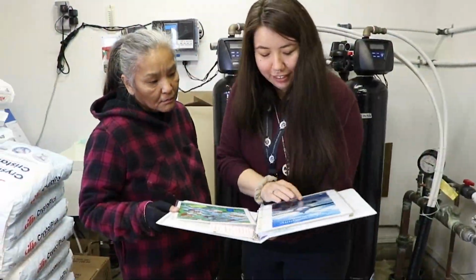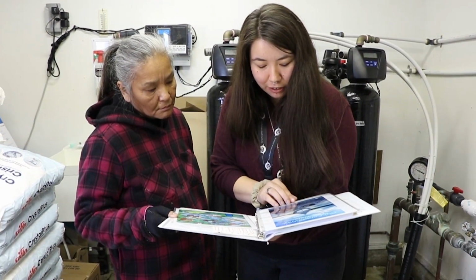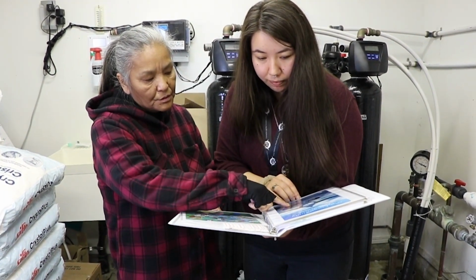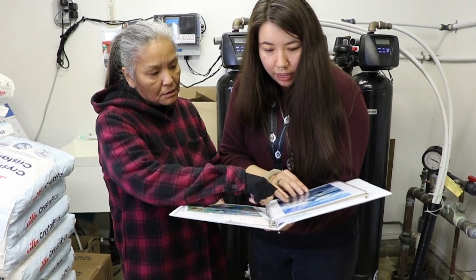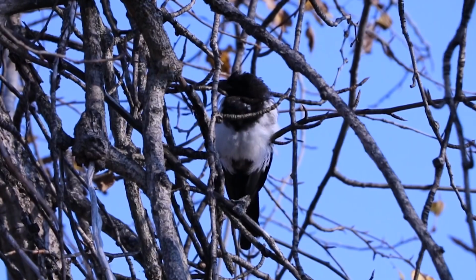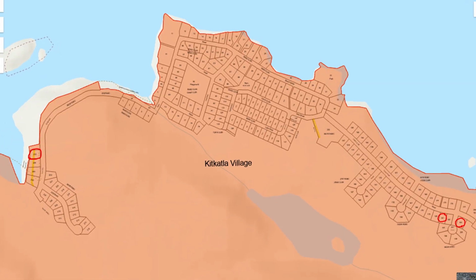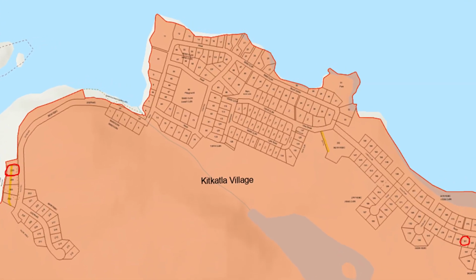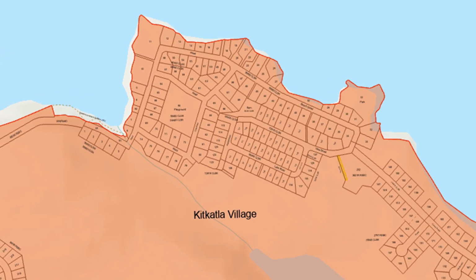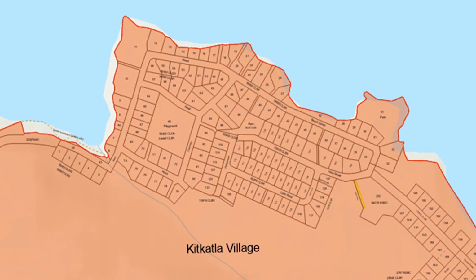Today we're going to go over how to pick your sampling sites. Before sampling collection can begin, you and your environmental health officer, in consultation with the water treatment plant operator and community public works team, must ensure that the sampling site selected will be representative of the community's drinking water system. Since sampling locations and distribution of sampling sites throughout the drinking water system can affect the quality of your samples and how representative your data is, developing a good sampling plan will ensure that your community's drinking water monitoring program is as effective as possible.